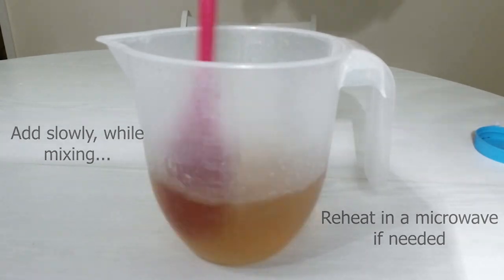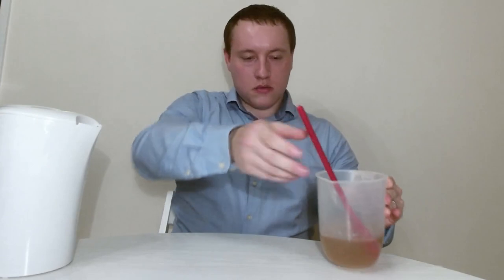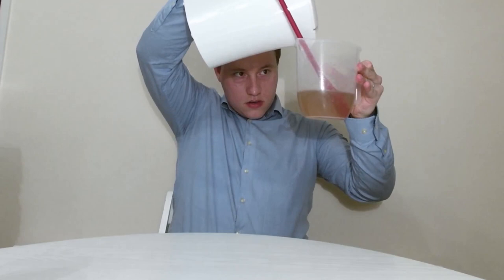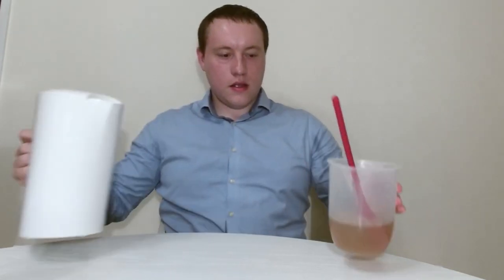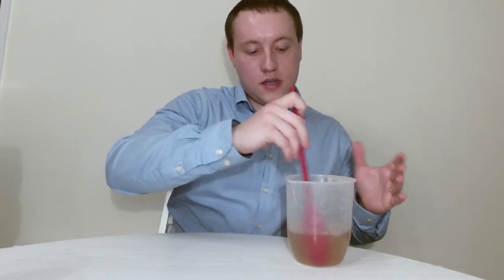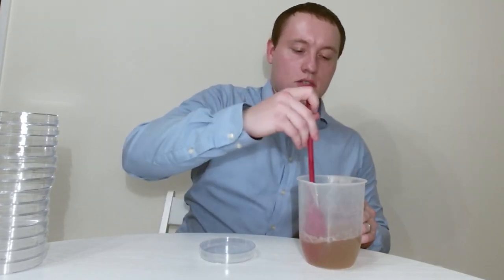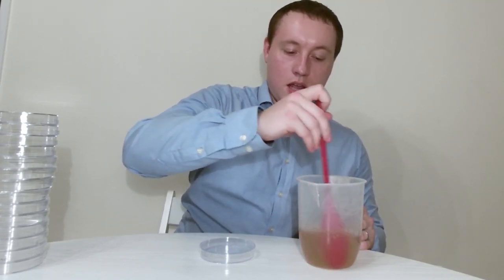Just remember to top up the volume with boiling water as it will evaporate in the microwave. Now I'm back and I've got my molten gelatin mix here — you can see it's all still liquid. I'm just about to top it back up to 300 millilitres with boiling water. I needed to heat the mixture in the microwave for a couple of minutes to allow all of the gelatin to dissolve, because it doesn't always dissolve straight away as the water cools down. Now it's all dissolved and ready to pour into plates. Each plate will hold about 20 millilitres of liquid, so with 300 millilitres in total we have enough for about 15 plates, give or take.